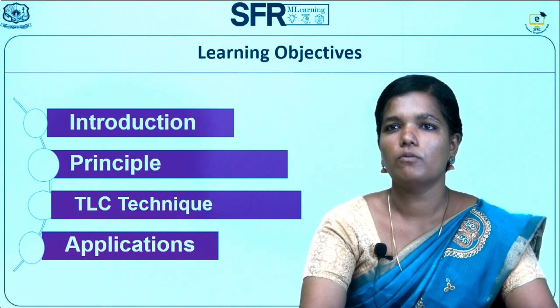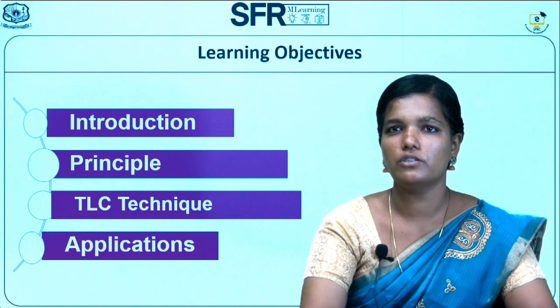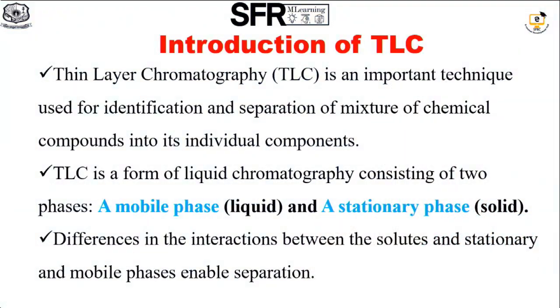So thin layer chromatography. The learning objectives are introduction, principle, TLC technique, and application of thin layer chromatography. So, introduction of TLC. Before moving on, what is TLC? TLC is an important technique used for identification and separation of a mixture of chemical compounds into its individual components.